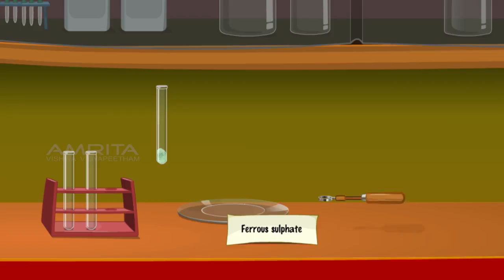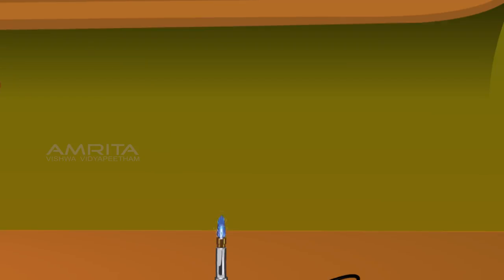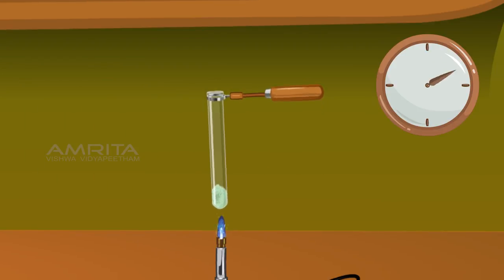Hold the boiling tube with a test tube holder. Heat the boiling tube over the flame of a burner.